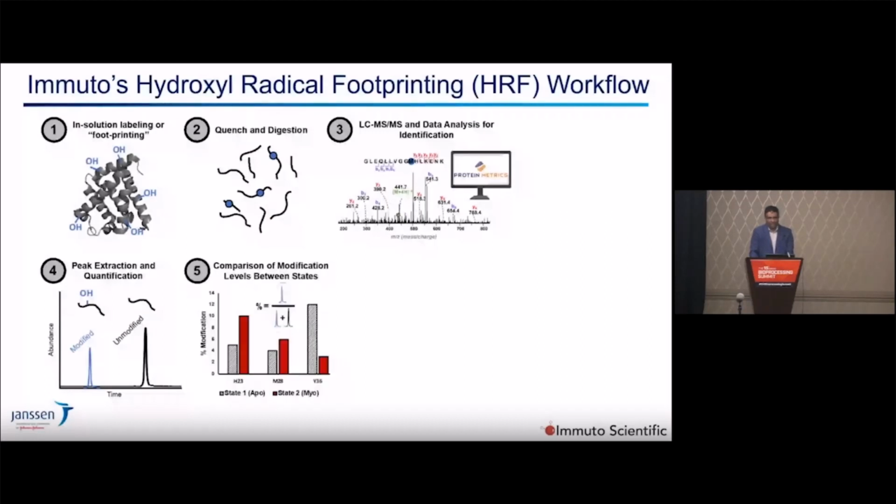So it's again a binary experiment. Here we are showing two states of the experiment, where state 1 is the apo form and state 2 is the holo form of this myoglobin molecule that was analyzed. Through the differential analysis of oxidation, we can then use this site-specific information to map it to a linear structure or a three-dimensional structure, as shown here, and then complete the experiment.